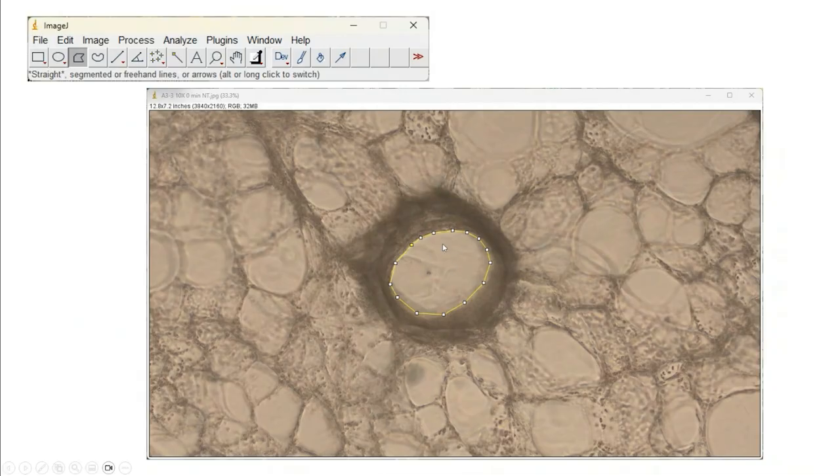It might be 50% contraction. A lot of times we get good 20, 30, 40% contraction, sometimes as much as 60% contraction. And that is a good pharmacological experimental treatment to validate the health of the smooth muscle ring. If you have contractile slices, then they are healthy.